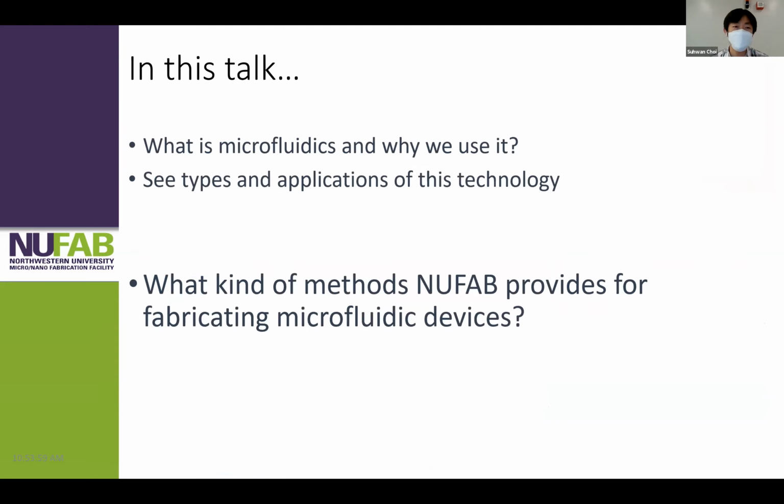Today we are introducing what microfluidics is and why we use it, what types of microfluidics there are, and what the applications of this technology will be. Mostly, we are introducing the methods available here at NUFAB for fabricating microfluidic devices. We're going to introduce three different microfabrication methods: microfluidic molding with SU8, laser cutter, and DRIE.